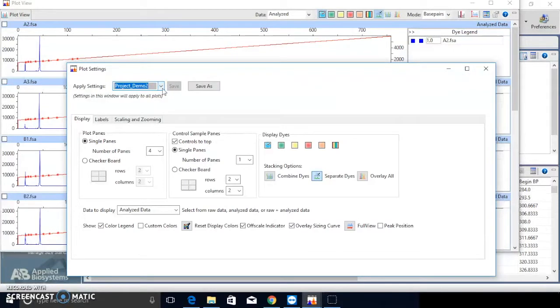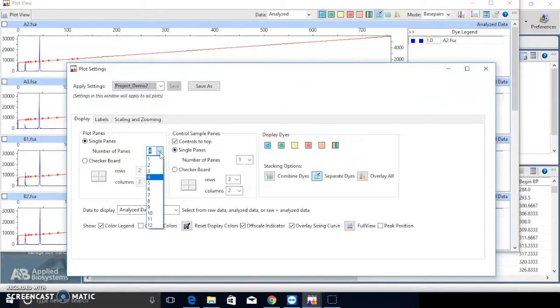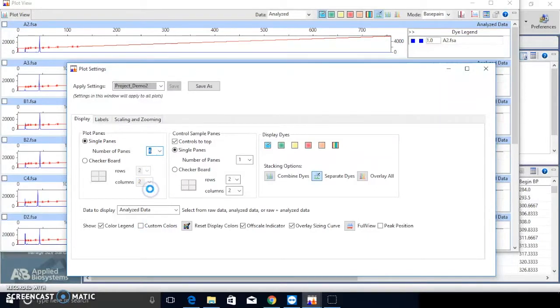I want to display six plots in one view, I select six here. If only one plot is displayed, please make sure you select All Samples for Plot View.